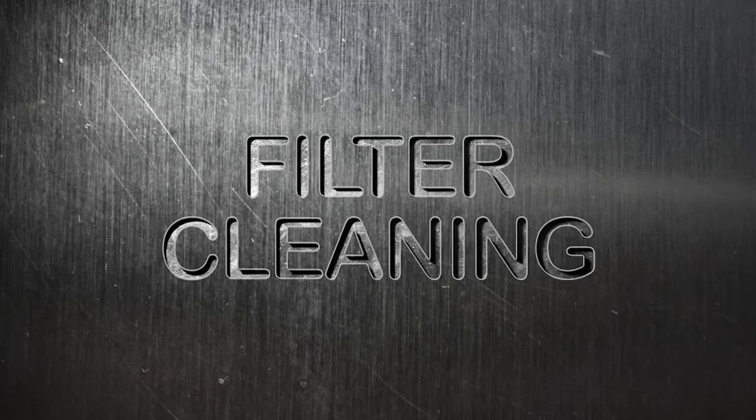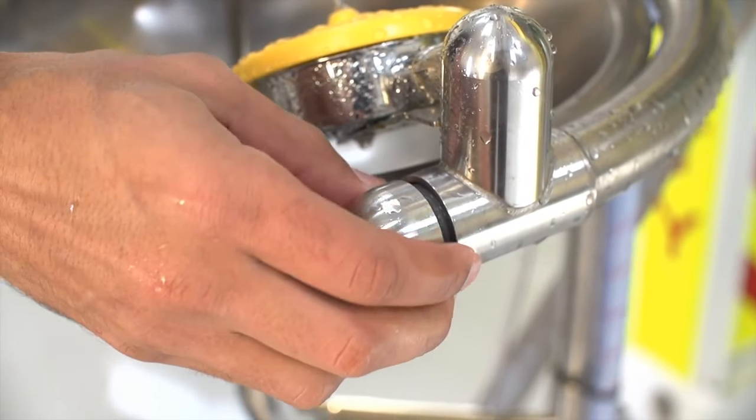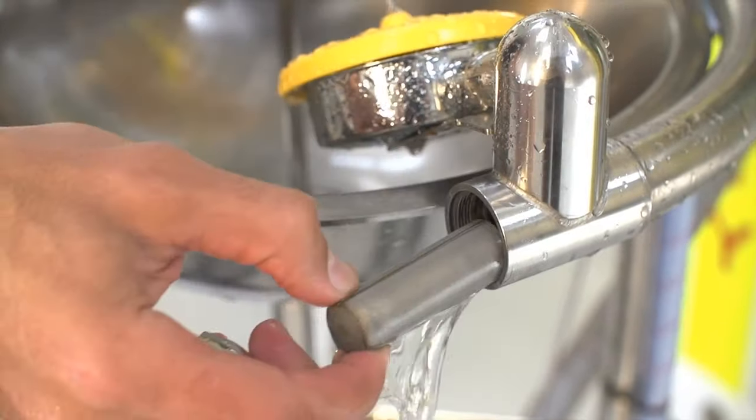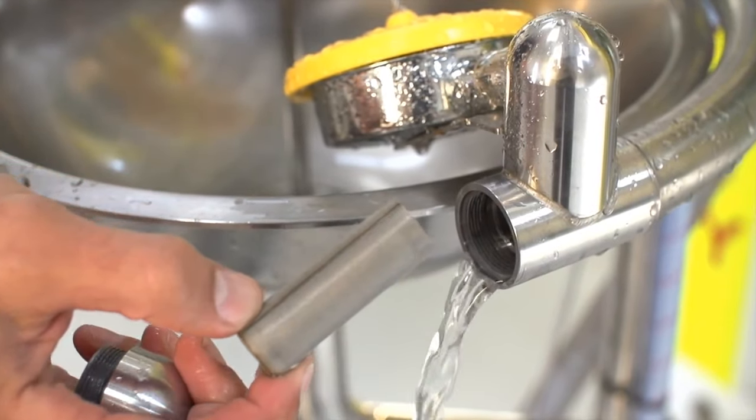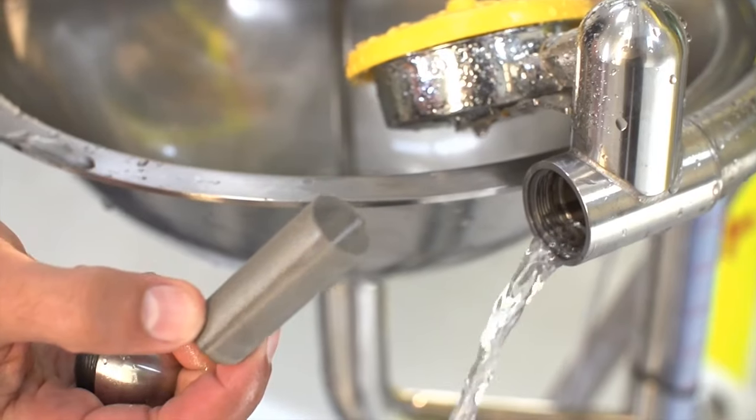Ease of cleaning filters: Ashley's filtration system is easy to access and clean, keeping maintenance fees low. A simple 10 millimeter Allen key is all that's needed to access both filters.